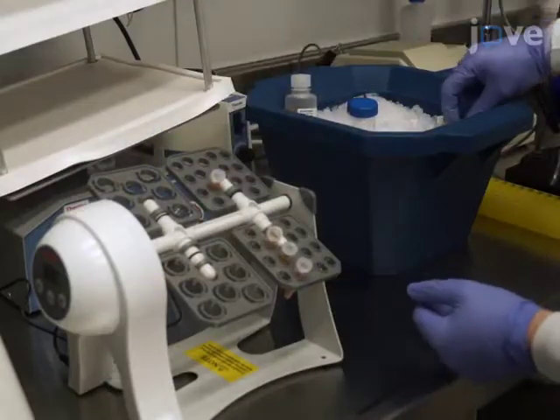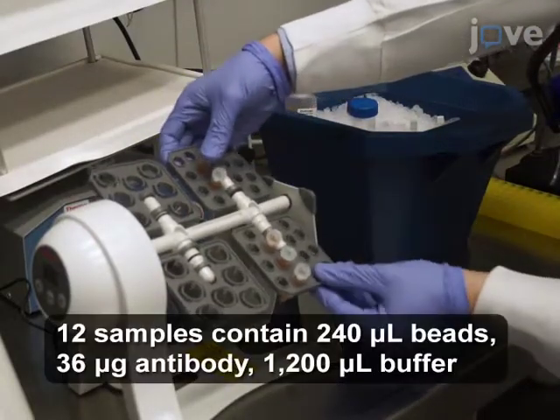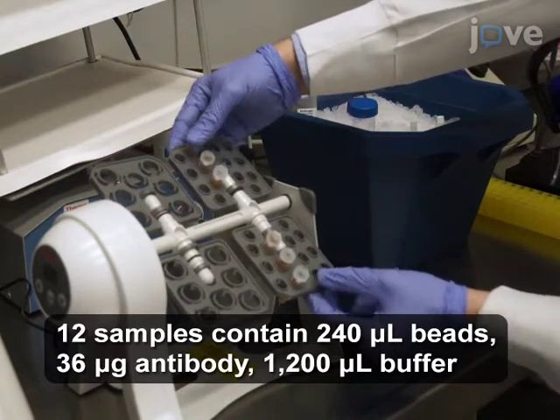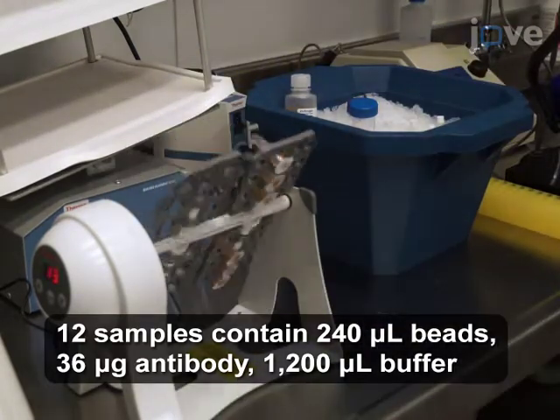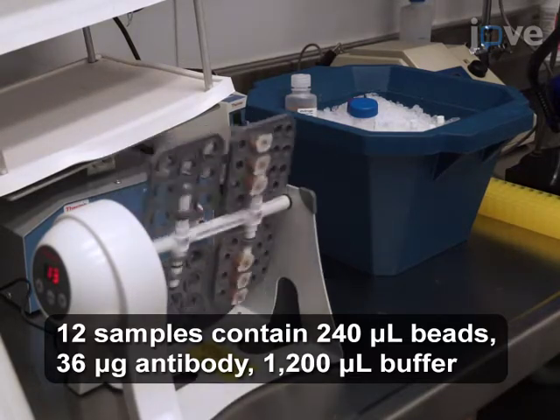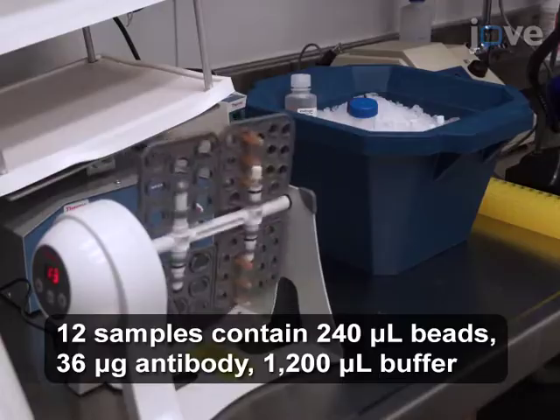For 8 mg of melanoma tissue, incubate 3 micrograms of each histone antibody with 20 microliters of protein G magnetic beads in 100 microliters of binding blocking buffer for 2 hours at 4 degrees Celsius with rotation using a tube revolver.